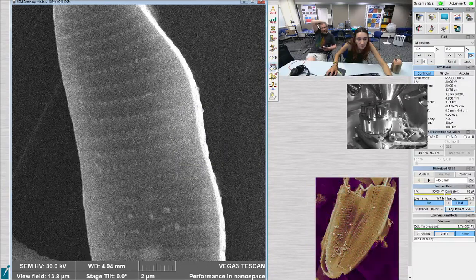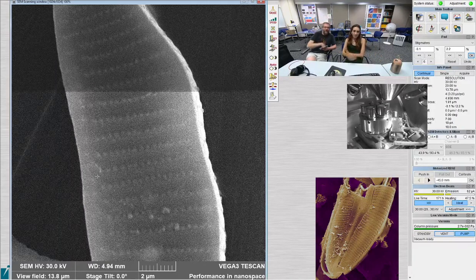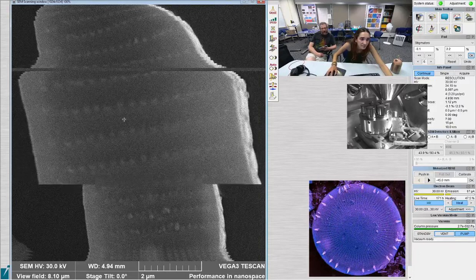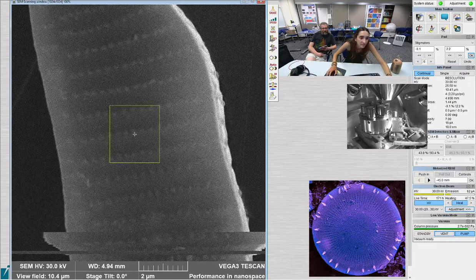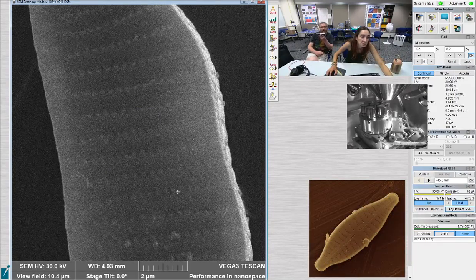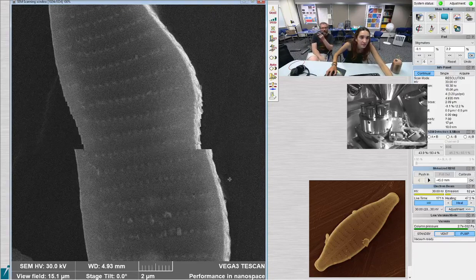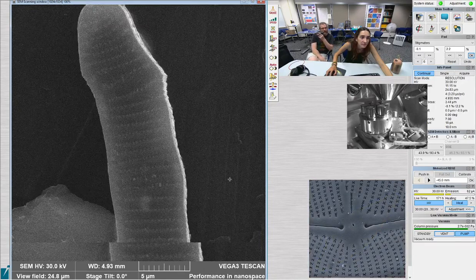I don't think you wanted to focus on that. I want to meet them. You want to focus on the actual areola. There. Yeah, they have like a bright boundary around them and it's in focus. Because otherwise I think you're going to get a little bit of the edge standing up on the side. Just a piece of a eunotia.